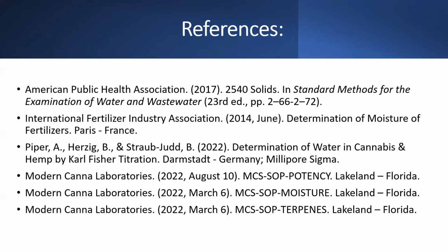Yes. So this is a very hot topic in the industry right now. We're seeing more and more lawsuits coming for false label claims and for inflated potencies, and laboratories doing things that they shouldn't be doing. And that's where this becomes a little difficult, because laboratories on the front end can find ways to inflate potency that will not be noticeable to a consumer or a cultivator or a processor who is having those tests done in the laboratory. So people may not be making their standards correctly, making a 90 ppm top of their curve but calling it 100. Or laboratories may be weighing different amounts than what their protocol calls for. Laboratories may not be diluting to the proper volume. So there's lots of things that can be done.